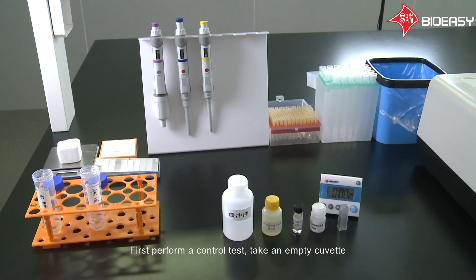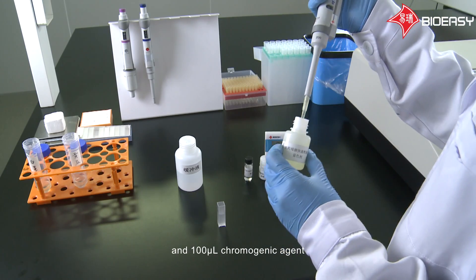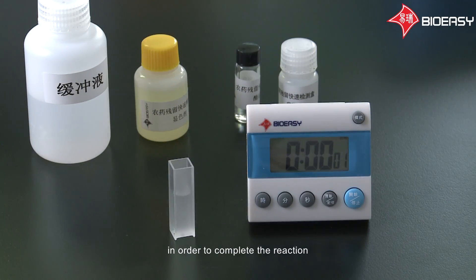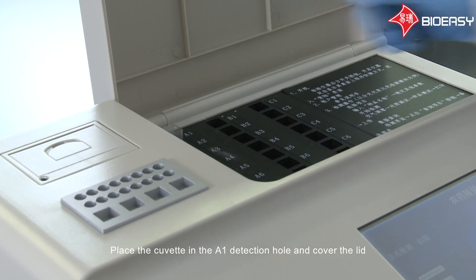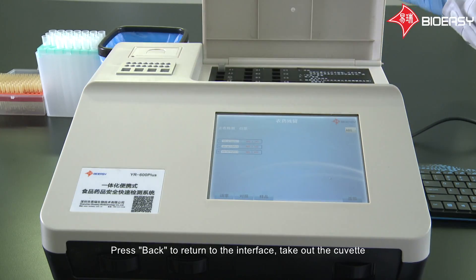Click Start Detection. First, perform a control test. Take an empty cuvette, add 2.5 milliliters of buffer solution, add 100 microliters of enzyme reagent and 100 microliters of chromogenic agent. Mix with pipette and keep in standing position for 10 minutes to complete the reaction. At the end of the time, add 100 microliters of substrate. Mix it quickly and put in the reader. Place the cuvette in the A1 detection hole and cover the lid. Wait for 5 to 6 seconds, then press the control button for the control test after the absorbance value rises steadily. Get the control results. The delta ABS value of the control must be more than 0.1. Press back to return to the interface and take out the cuvette.